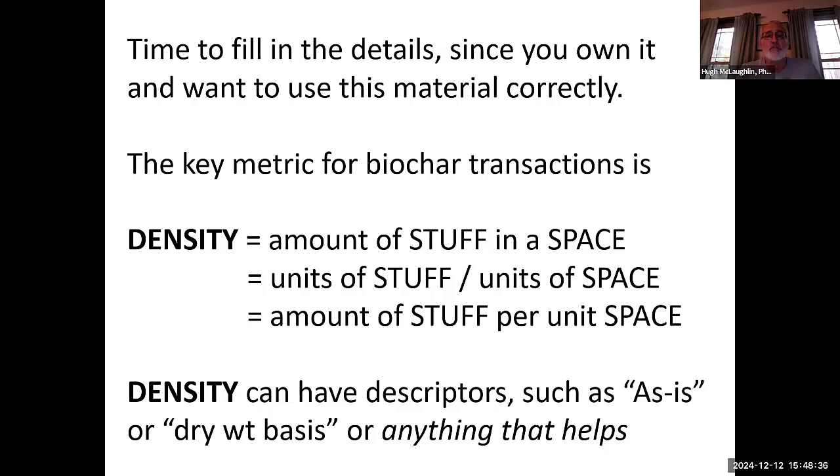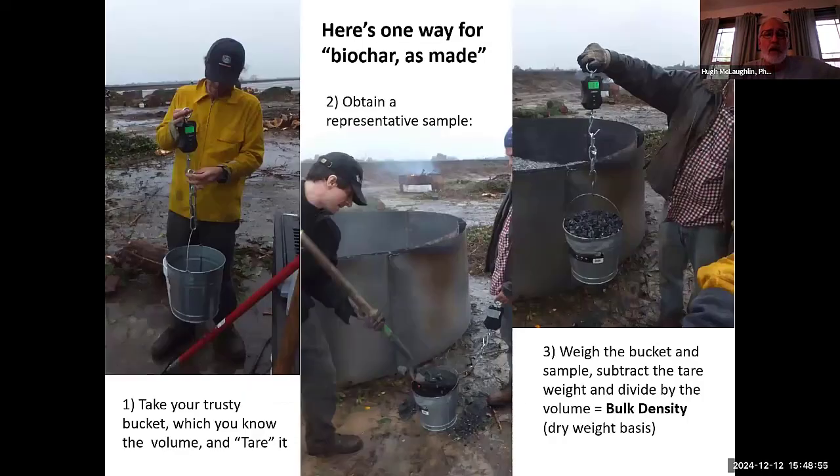And as you're using biochar, typically you're dispensing it as a volume. You're picking it up with something or putting it into bags or somehow moving it around. But you need to know the amount of actual material held in that volume, and that varies depending on a number of things. Here is an example of measuring, and what some people may accuse as a crude way, but frankly, any data is better than no data.